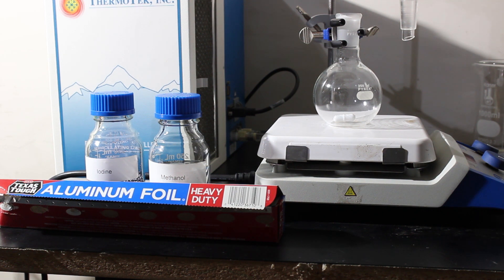This is a procedure that I first saw done by Chem Player. If you don't know who Chem Player is and you're watching videos like this, you need to go find Chem Player's videos and watch all of them because they do it way better.